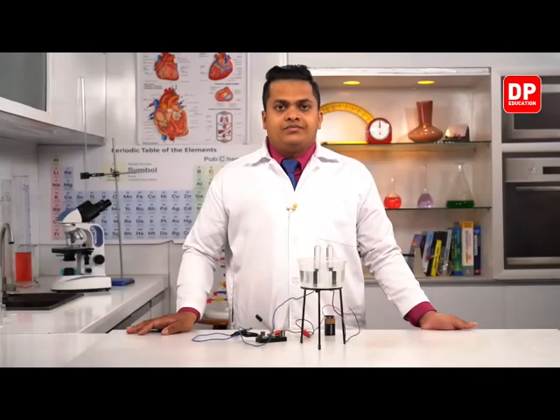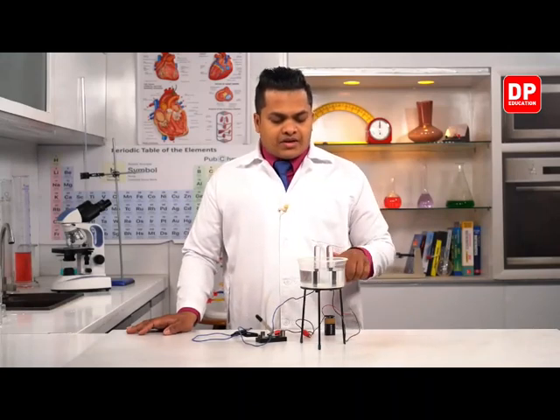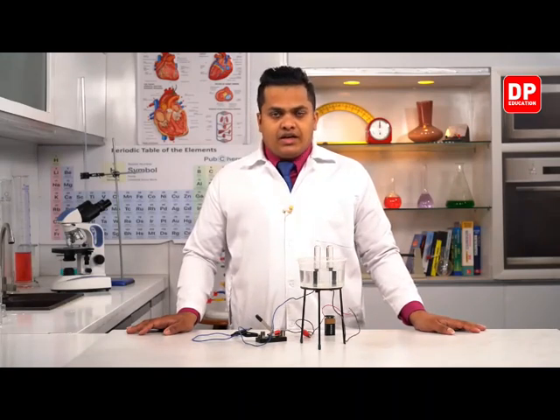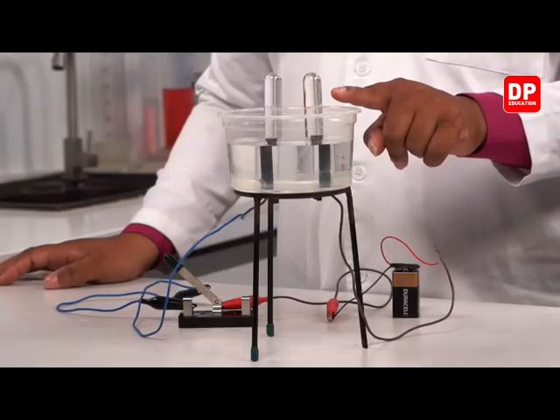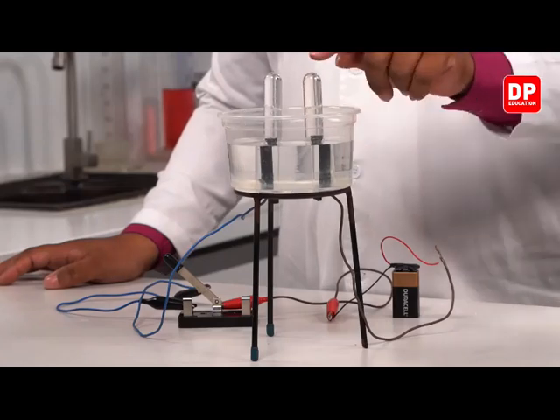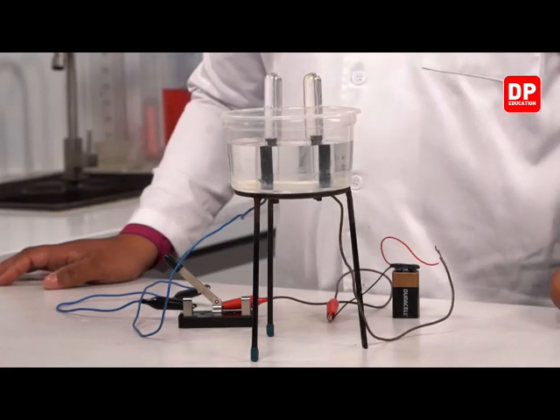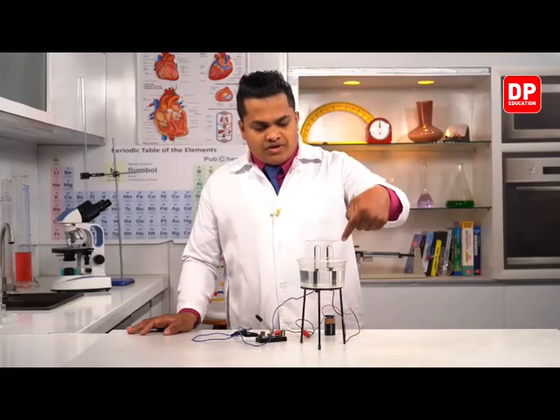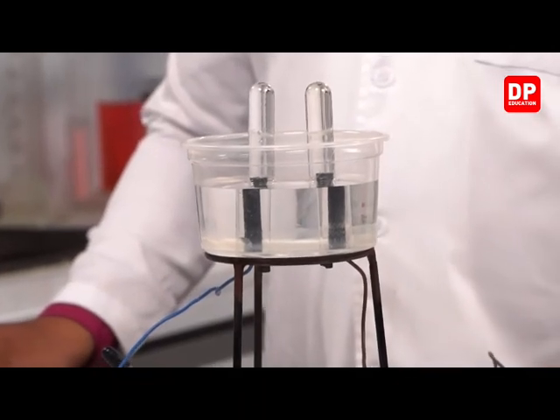So my dear children, as you can see here, this is the setup which I have prepared to investigate the electrolysis process of acidulated water. This is acidulated water in the trough. These are the two gas jars or test tubes. As you can see here, there are two carbon rods. This is our dry cell.